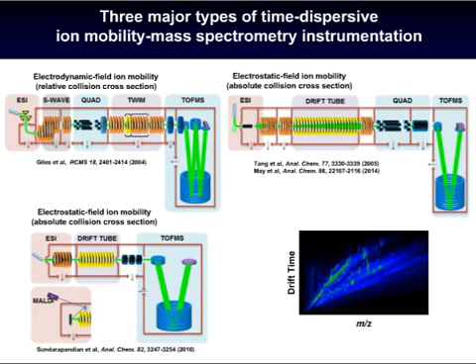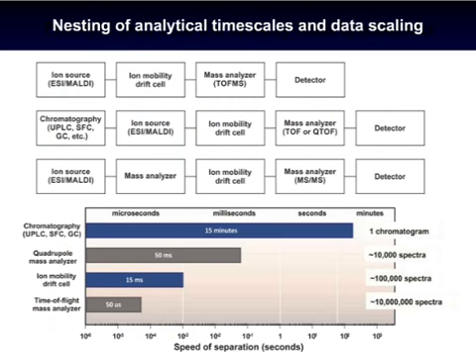And then in the upper right is the implementation by the PNNL group, which was later released by Agilent, which George covered very eloquently. So I'll be showing you data from all three of these types of platforms in this presentation.